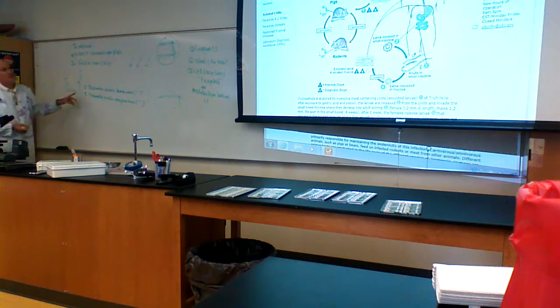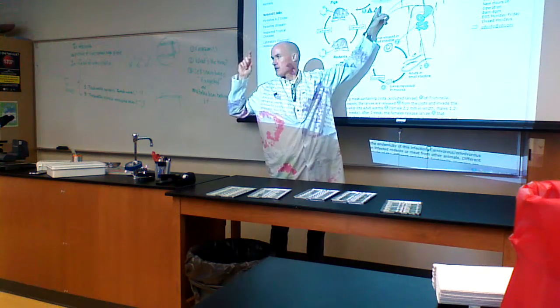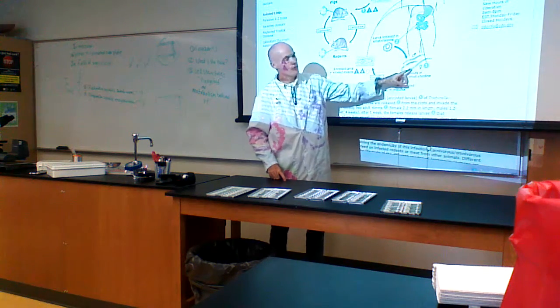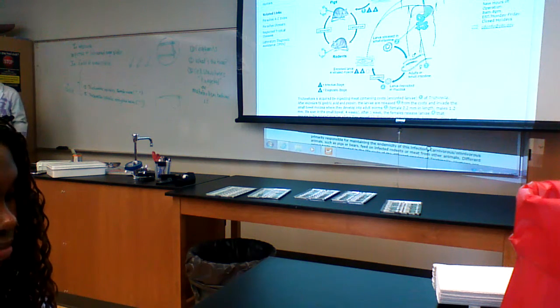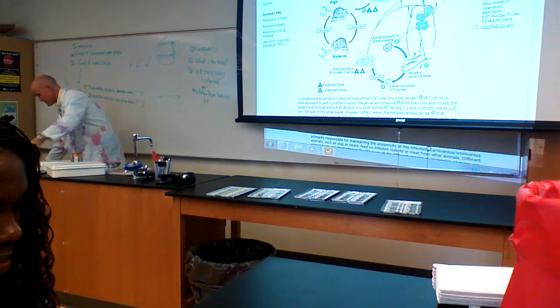So what you'll be looking at, I want you to get a sense for the encysted larva, and you'll see it'll be in muscle. And then the female worm, which is probably actually from a rabbit. So this is what you want us to draw, the worm and the... Yeah. So draw the female, which is a worm. Looks no different from any other worm. Yeah, the circle you see, and the encysted larva, which looks a little different. That's why it forms the spiral thing, the spiralis. Yeah. I think I do. I did last semester. That's it. That's all I want you to do.